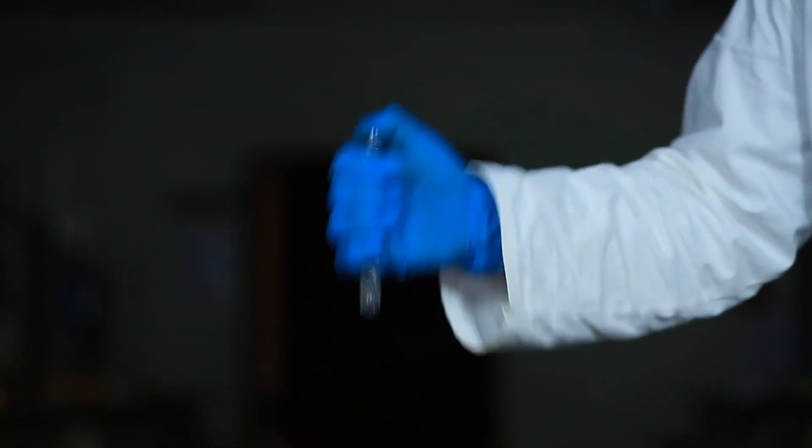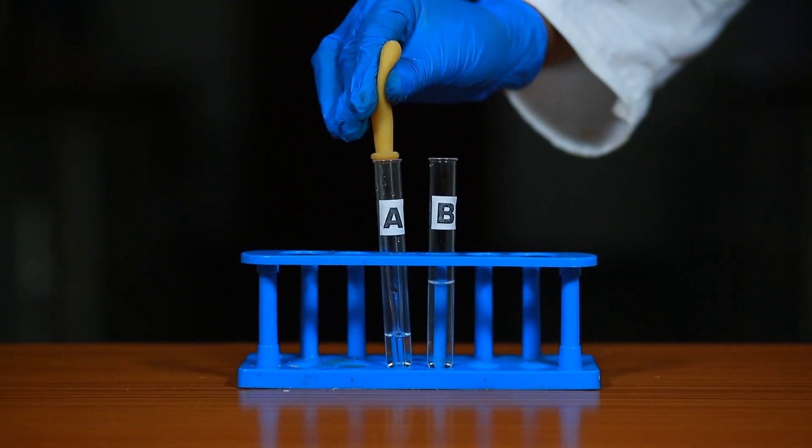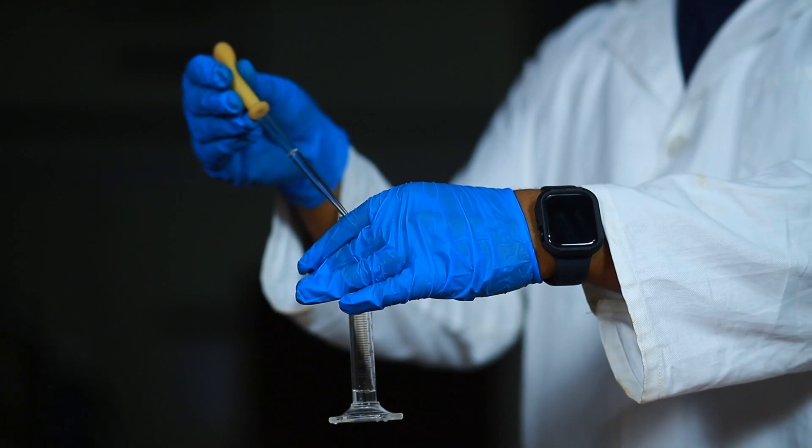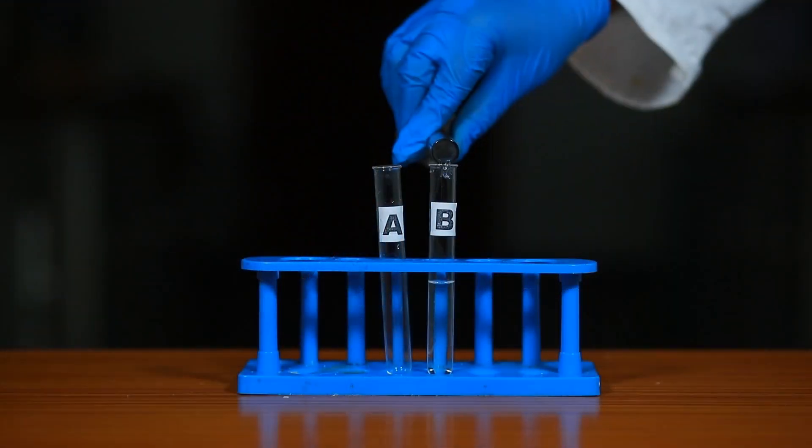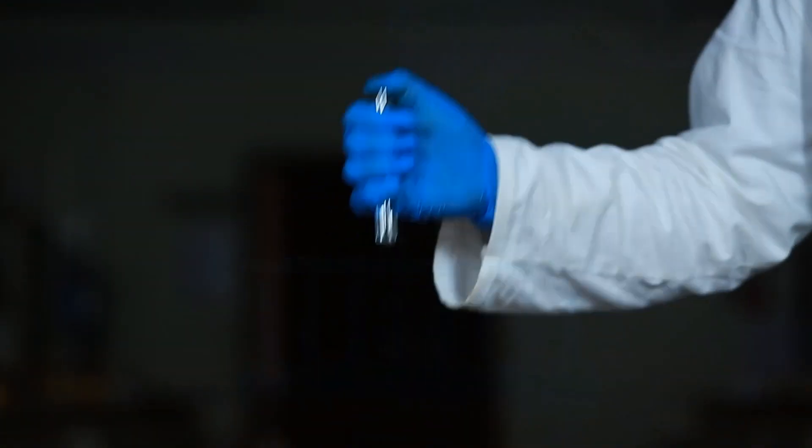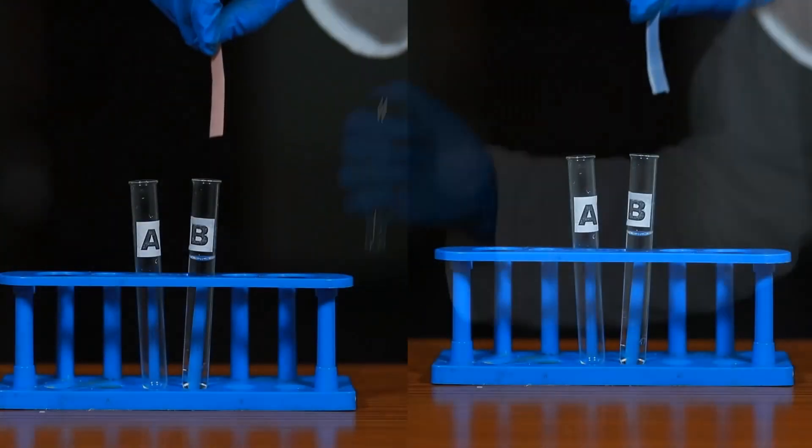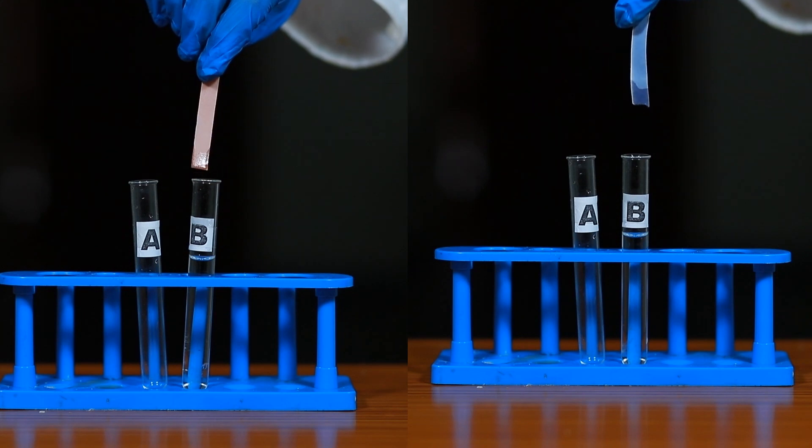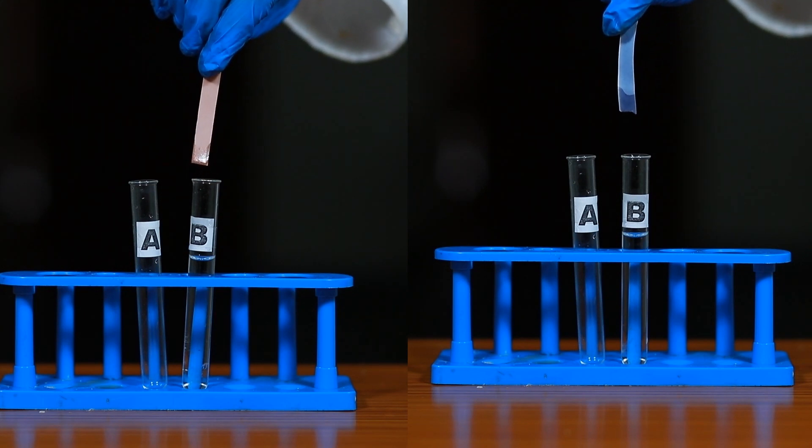Keep on adding the dilute HCl 3 ml from test tube A to dilute NaOH in test tube B drop-wise till the reaction mixture in test tube B becomes neutral to litmus paper, showing no color change of blue and red litmus when pH of the solution is 7.